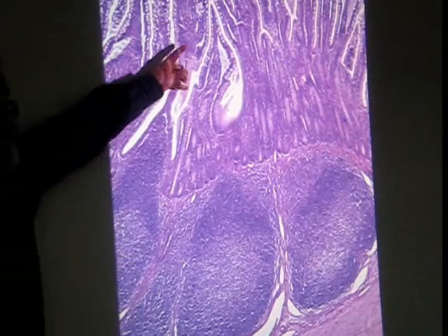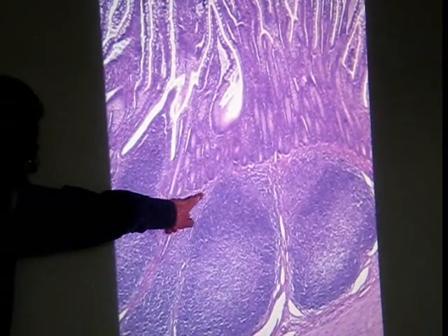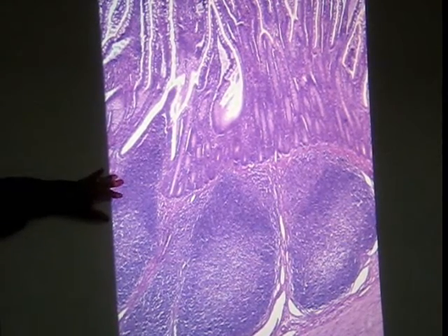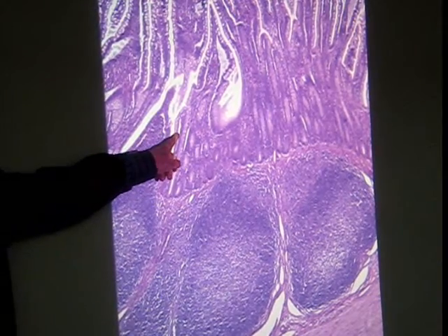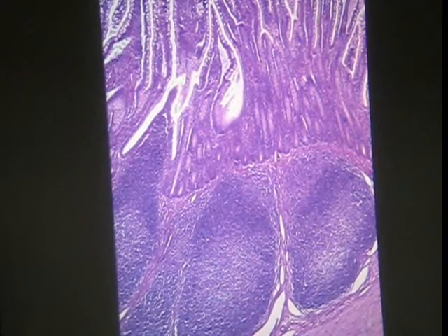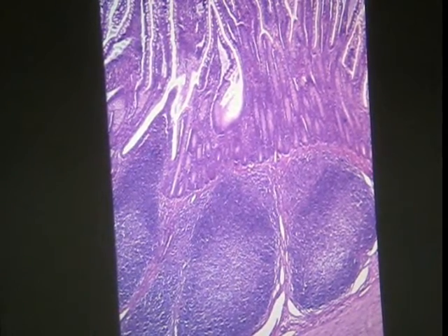We've got villi. You can pick up the goblet cells quite nicely, except for on villi like this, where right there is muscularis mucosa, and look how it's just kind of disintegrated because the infiltrate is so intense. Right along here, you're lacking goblet cells. Here, just across the way, you pick them up. So this would be a good place to start scoping for M epithelial cells or M cells, right? Especially if you're going to do electron microscopy, I'd trim the block down in a region like that.